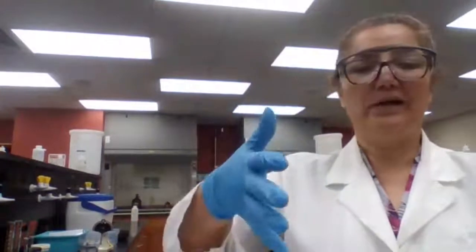The prismatic crystals are the right hand with right hand crystals that we actually need for this experiment. The other crystals actually stay in the liquid form. Because your hands are chiral, that was the better explanation of how a chiral compound can react differently with different enantiomers of a pair: right hand with right hand, or right hand with left hand.